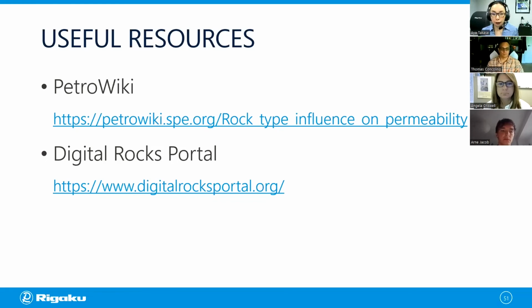If you don't have a lot of CT scans or SEM scans to practice analysis on, but you want to get started, then you can take a look at this website because they have a whole lot of sample images. You can download the actual images, and most of the images come with the original paper published with the analyzed results. So you can see what people analyzed from those data sets, and you can actually get the data sets to do your own analysis. So this is a really good site when you're practicing analysis.